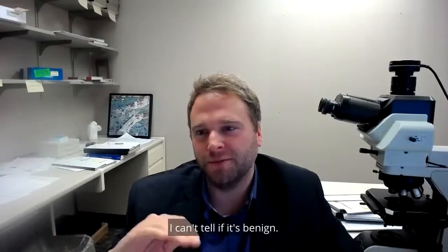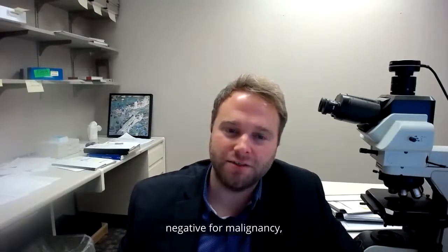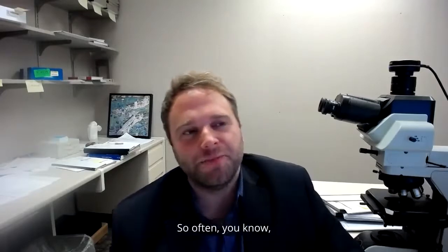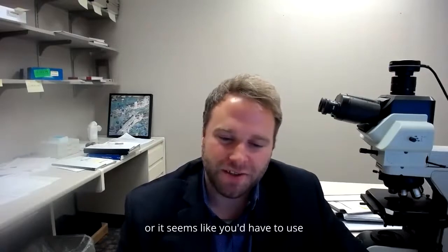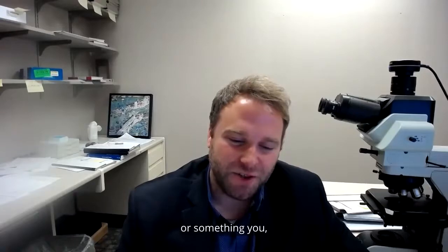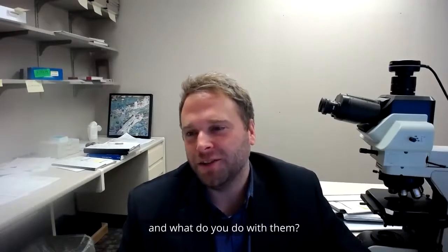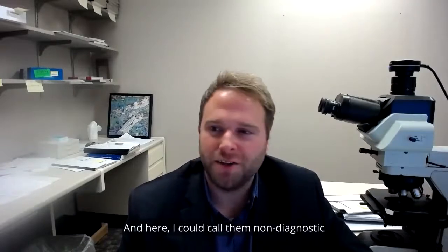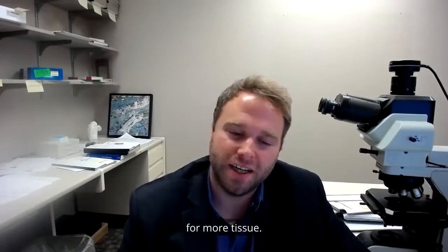I can't tell if it's benign. I can't tell if it's malignant. So I'm going to leave it at atypical. And then of course, negative for malignancy. And then beneath that, non-diagnostic. So often the really challenging ones seem like you'd have to use reading tea leaves or something. You debate between non-diagnostic or atypical, because I have these like 5 cells. What do you do with them? I could say they're atypical, sure, but that doesn't really help anybody. Or I could call them non-diagnostic, and that of course would tend to send them back for more tissue.